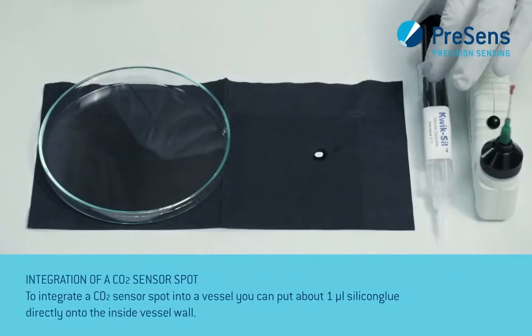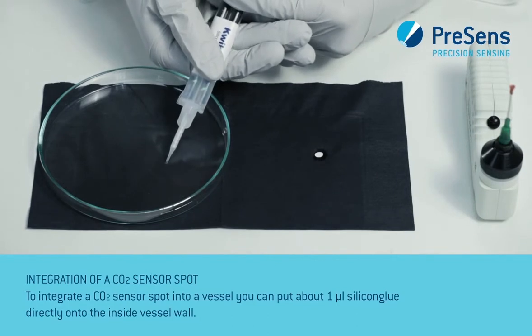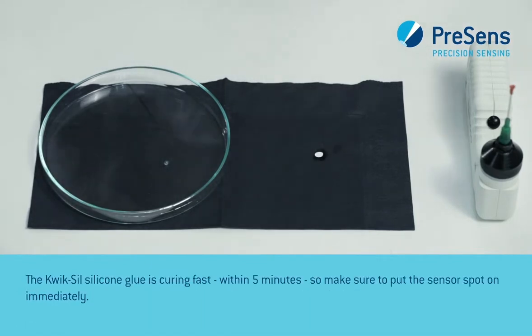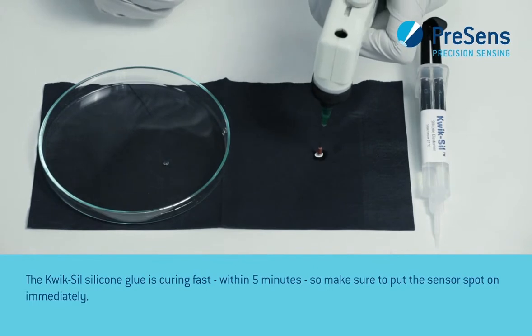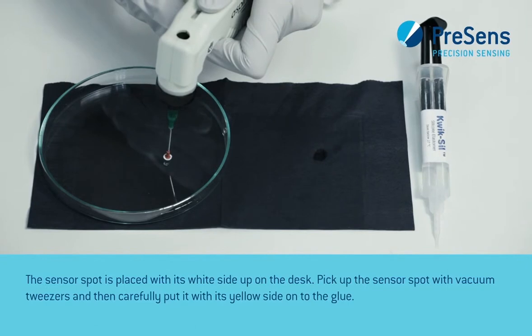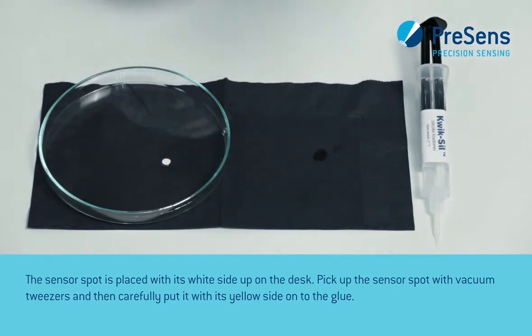To integrate a CO2 sensor spot into a vessel, put about 1 µL of silicone glue directly onto the inside vessel wall. The Quicksil silicone glue cures fast within 5 minutes, so make sure to put the sensor spot on immediately. The sensor spot is placed with its white side up on the desk. Pick up the sensor spot with vacuum tweezers and then carefully put it with its yellow side onto the glue.